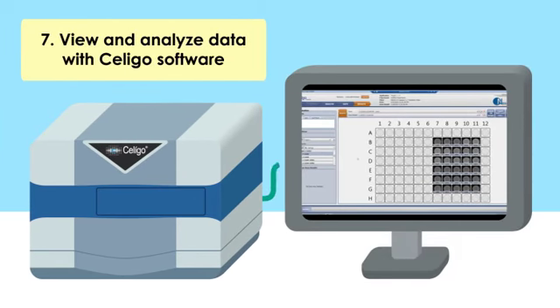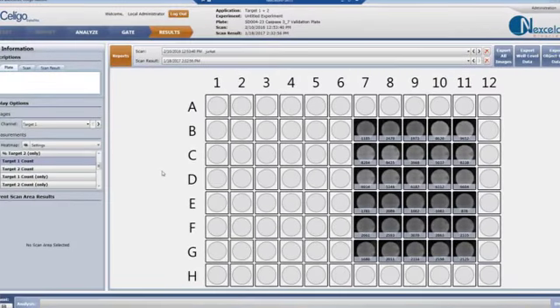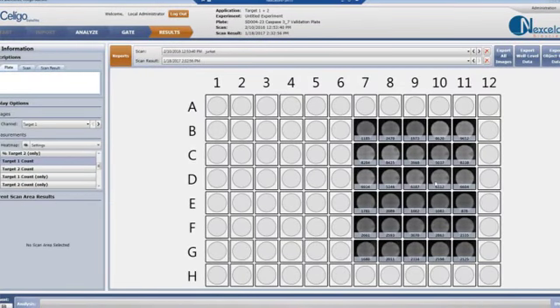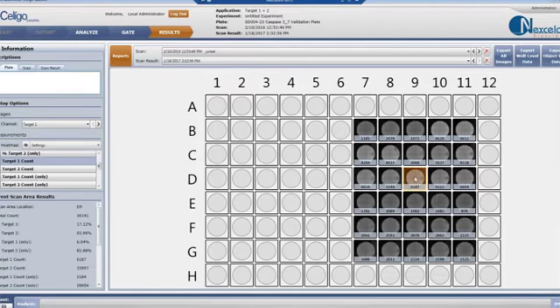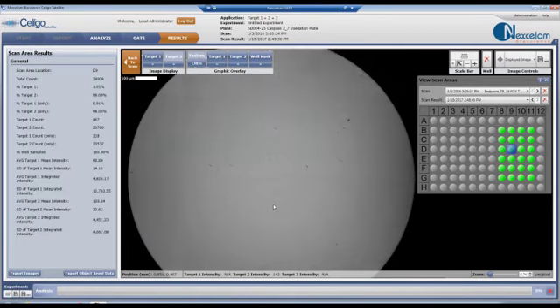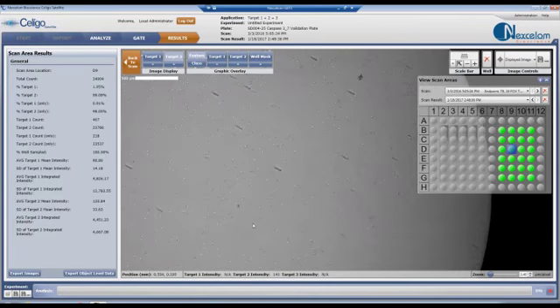The analyzed results are displayed in a plate-based format showing a thumbnail picture and the number of apoptotic cells for each analyzed well. Let's take a closer look at a treated sample in well D9. By double-clicking on the well, the whole well image appears for review.